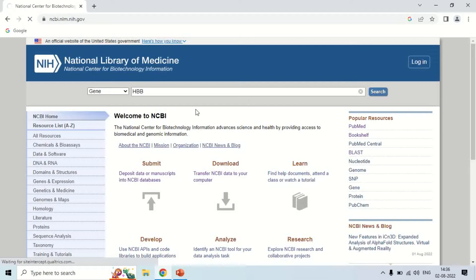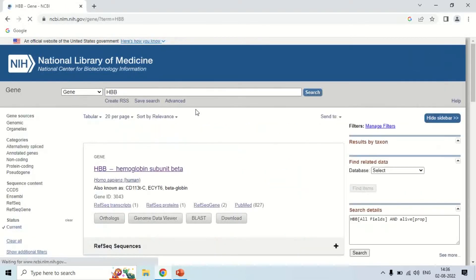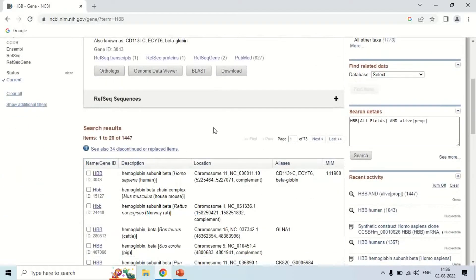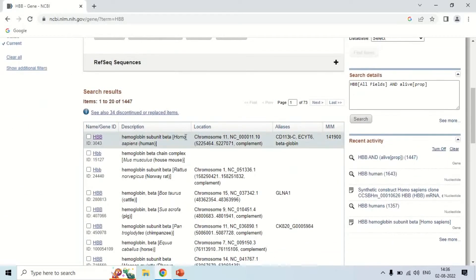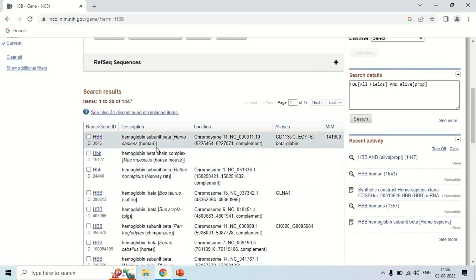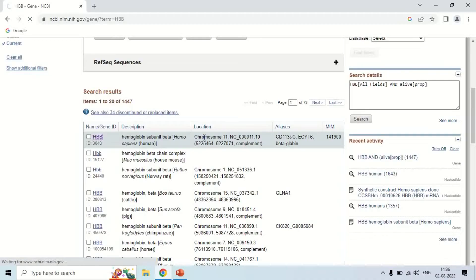Now the search results for the hemoglobin beta gene show entries in homo sapiens, mouse, rat, and cattle. I am going to work with the hemoglobin beta gene of homo sapiens — that is, human. Just click here to open the sequence of this gene.